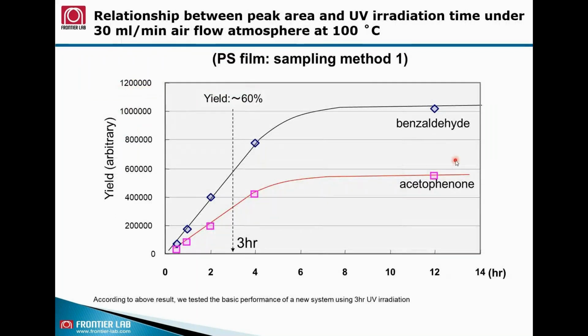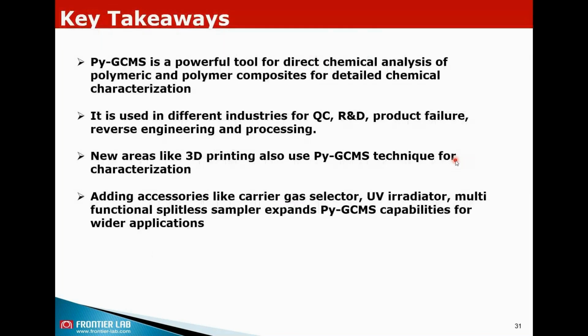Okay, so I think that's pretty much what I have to share. The key points from today's whole session: PYGCMS can be seen as a powerful tool because it expands the capability of GCMS and allows you to analyze solid samples directly without any extraction.